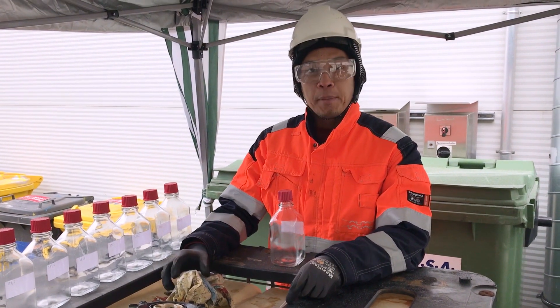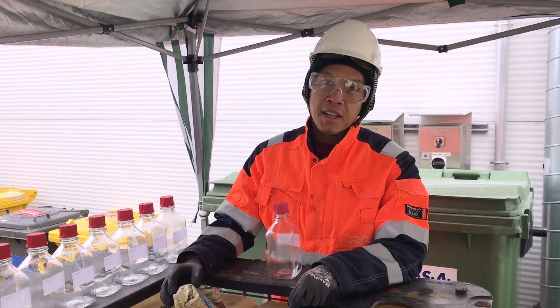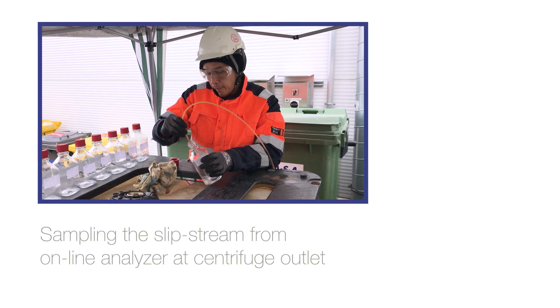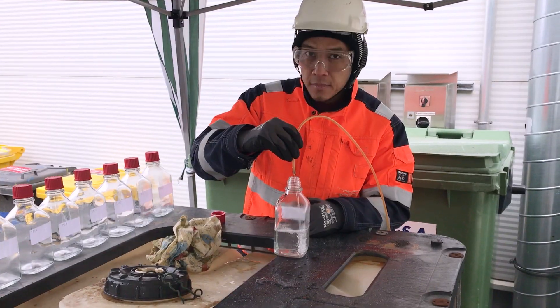Right now we're taking samples from the Explorer outlet to analyze in the customer's lab. Looking good.